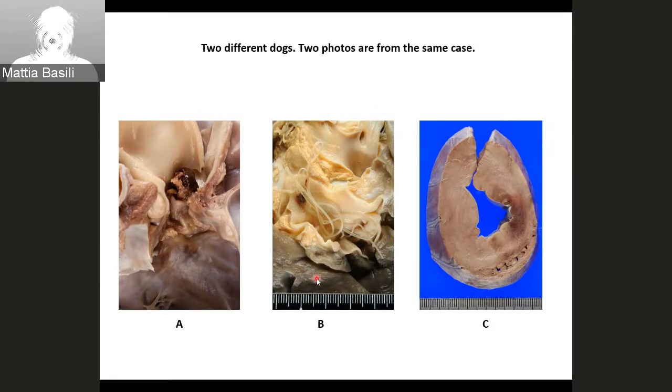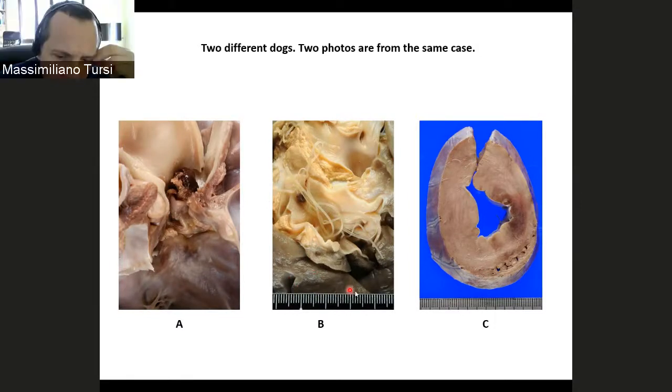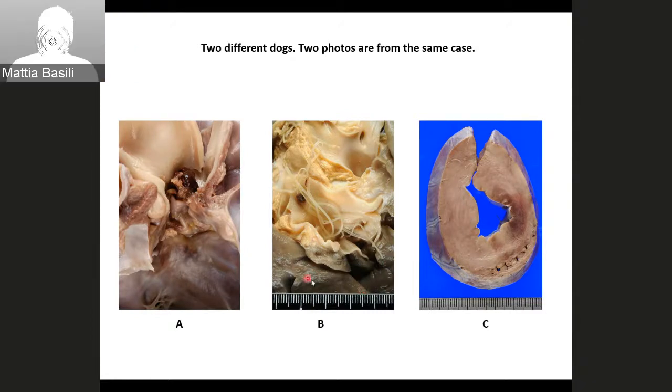And where we are here, we are at the base of the heart. We've got an open artery that I believe is the pulmonary artery in this case. But here it is not heart. I guess it's the lung. That's lung, sure. That's, of course, a branch of the pulmonary artery close to the lung.